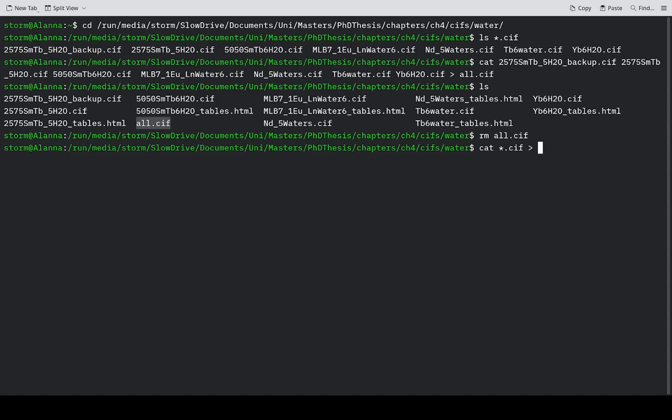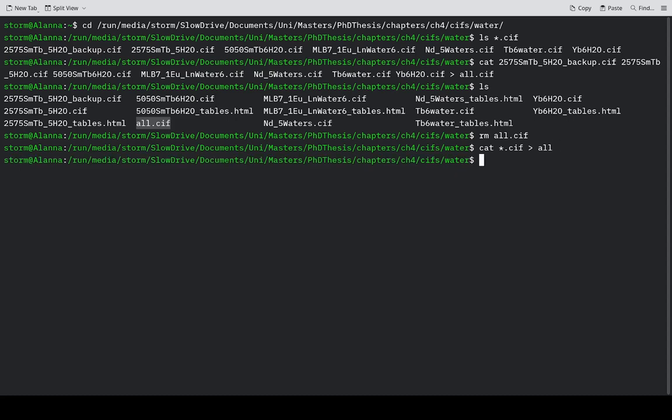That's a bad idea. So we just use 'all' which doesn't need an extension. If you want, you could give it all.fake. But whatever will work.